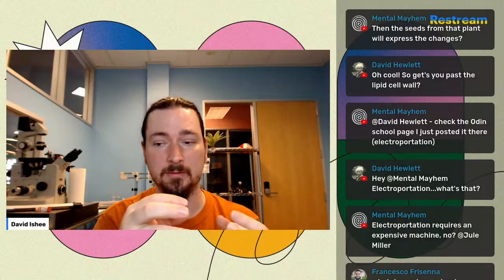Weeks and weeks later, it'll become a callus, and you'll have this little, literally just a little blob, tumory looking thing of little green cells that are just, well, I guess in this case, they'd be little red cells. But if you're making spicy tomatoes or something, they'll be green. And they're sitting there.